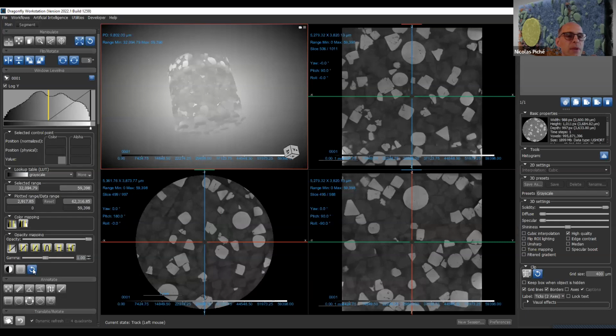Okay, so window leveling is a complex tool. You can have multiple of them, each for 2D, for 3D, for all the data sets, because each coloring and opacity setting is per data set, and you can have multiple data sets. Yes? Is there any correspondence between the 2D and 3D settings? You can create a lookup table and apply it to the other one, but besides that, there's not a lot of correspondence, because volume rendering is another technique, quite different, of showing the values on screen.